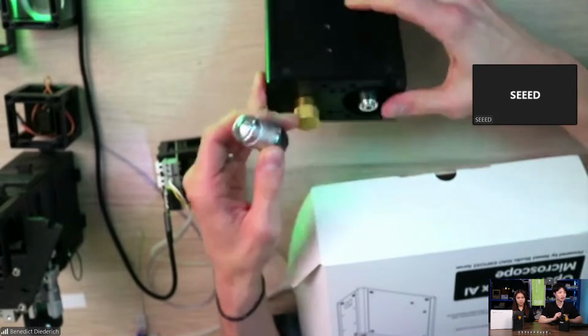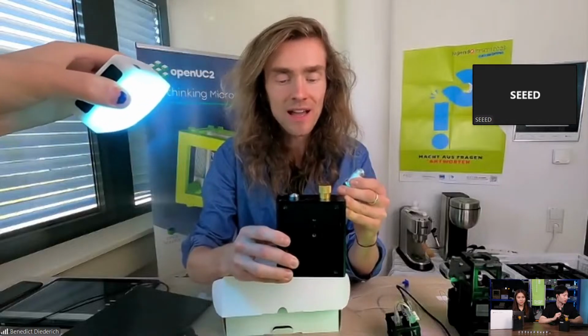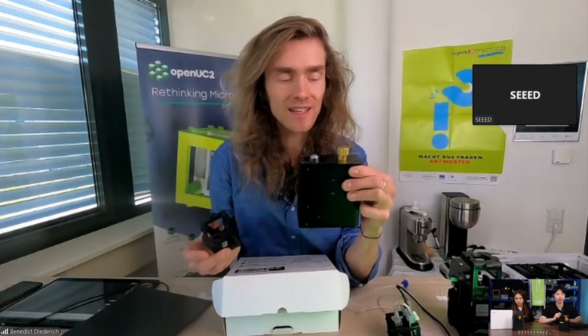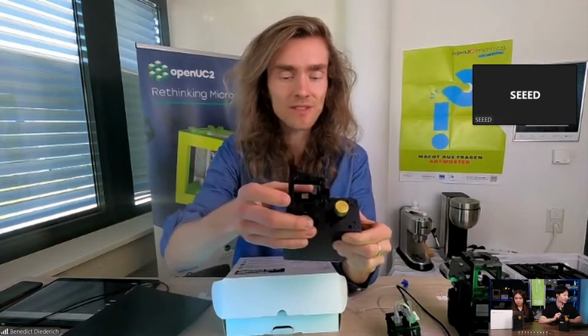This has the advantage that you can, for example, look at samples that are in aqueous solution. And how this works, I'm going to show you. It's really simple to set it up. So the box here is not only a black box, but it's actually open source. So you can adapt, for example, cubes.